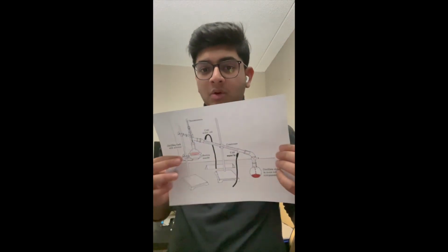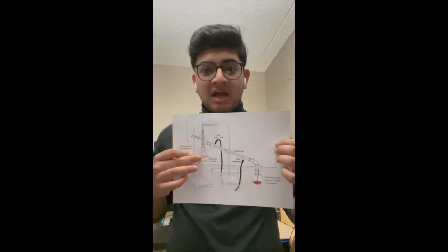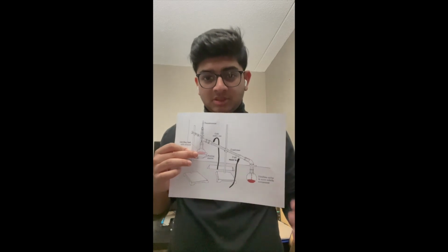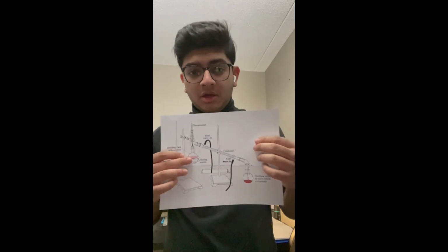So in our organic chemistry lab, we were given a mixture of two substances with different boiling points, and we used simple distillation to separate this. This is just a basic setup of how distillation should look. First we have our distillating flask, in which we have the mixture or solution of our two substances. The first step is to start heating the solution.